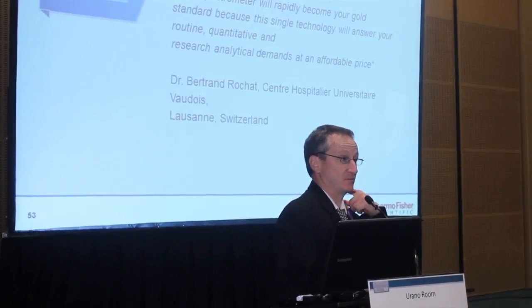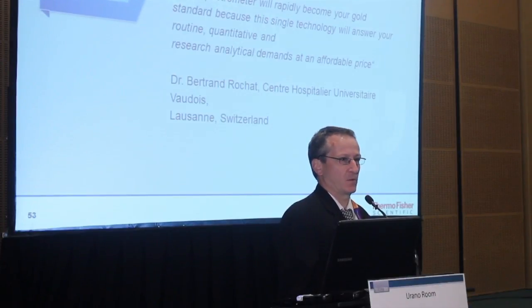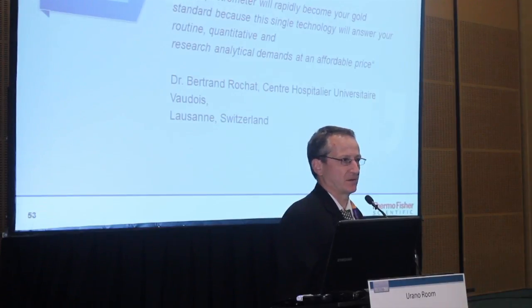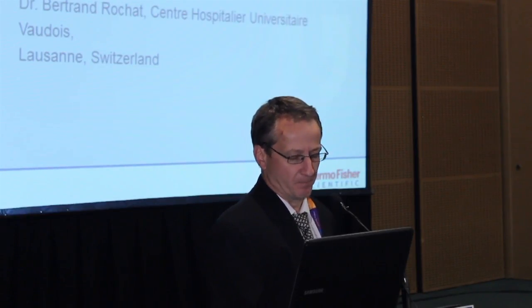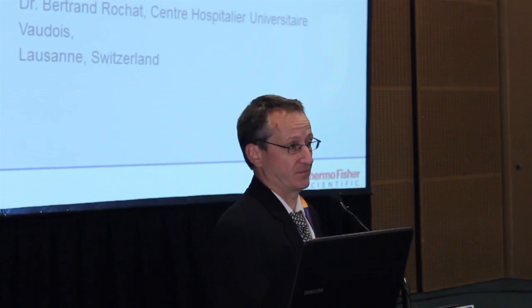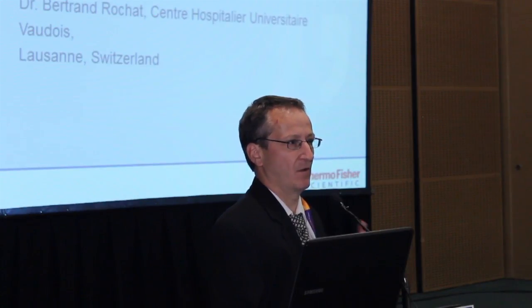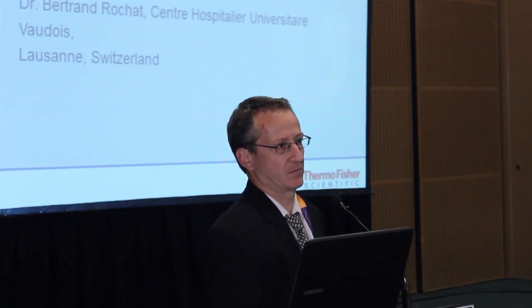So I have this instrument only for a couple of months, and I didn't have time to produce data yet to present here today. But I still work with Q Exactive and Exactive Plus instruments. And as I said this morning, I invite you to consider this kind of technology, high resolution, for your routine analysis. I'm pushing that for the last few years already. I think with this instrument, this is a kind of silent revolution. On one point, the price, I don't know exactly the price, but I think what they told me, this is the same price as a triple quad, right?